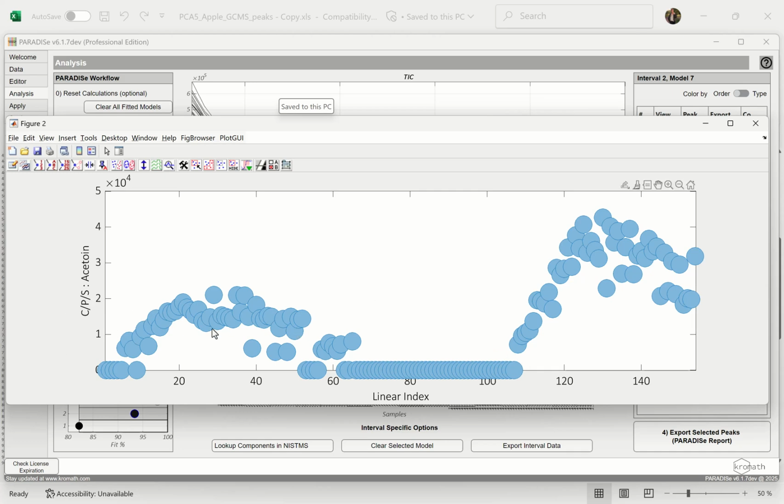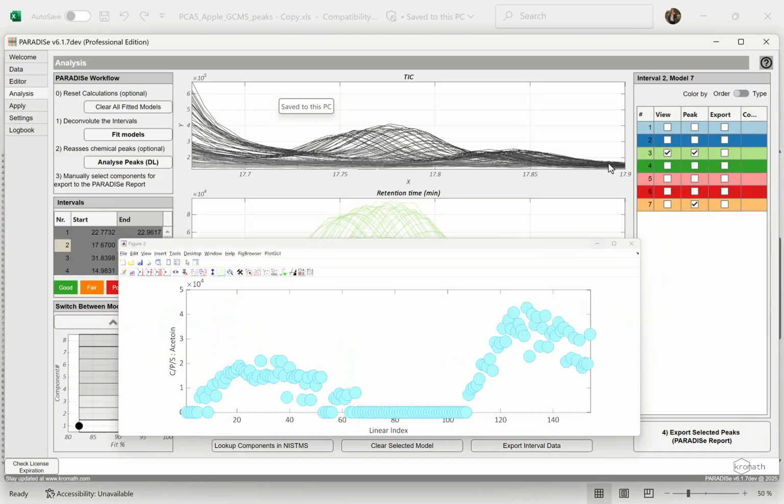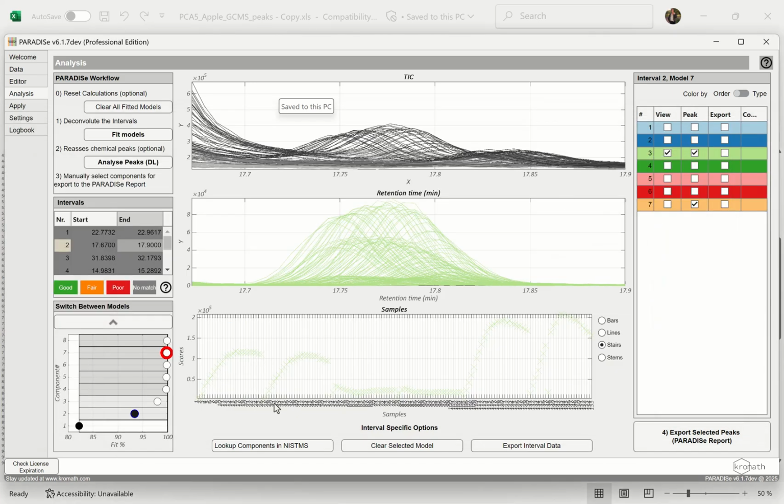So we had the 2 fermentations with this organism. These ones were basically almost all of them below a limit of detection. And then we had this third one. Now, the sample order is different here. So we have 1 fermentation with this organism and the second one. Then we have 2 of these ones and 2 of these ones. Now you can see not only do we quantify the samples everywhere, but also the quantifications are just nicer. It's a smoother curve, indicating that the estimates are more accurate. But look, the samples are quantified in each and every sample.